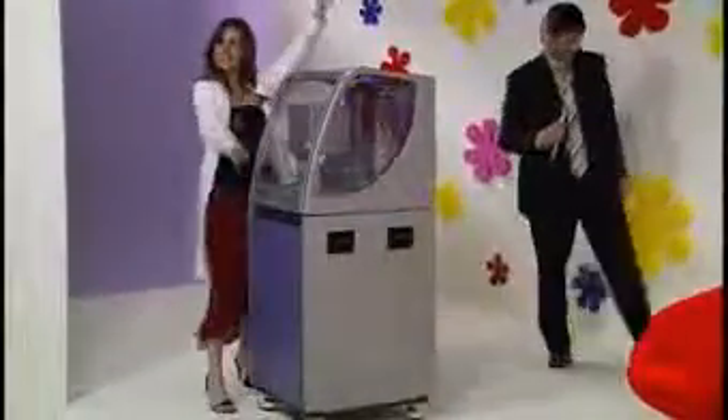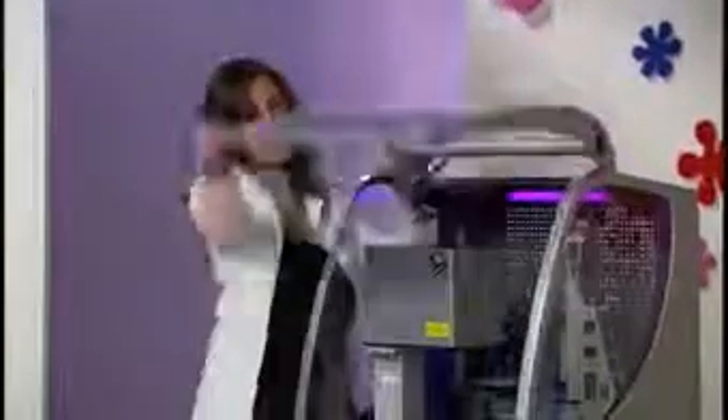Our lucky couple will be spending an all-expenses-paid work in the lab with the Caliper Life Sciences Lab Chip 90 system. The Lab Chip 90 is a revolutionary system for DNA and protein gel electrophoresis. It can run 96 or 384-well plates in the lab and can analyze a DNA or protein sample in just 30 seconds. Don't work harder — work smarter!